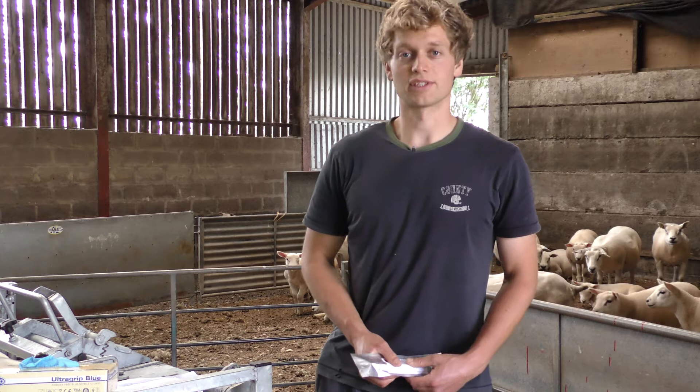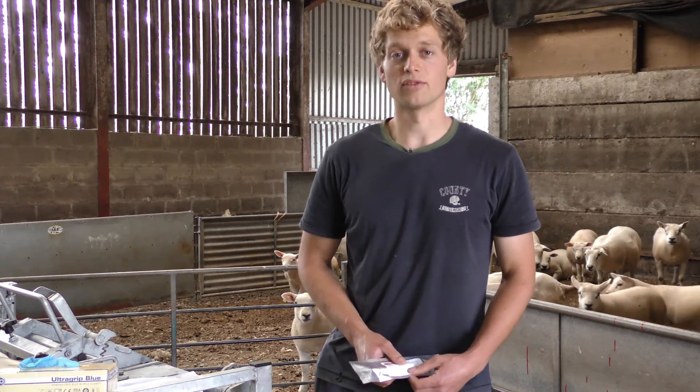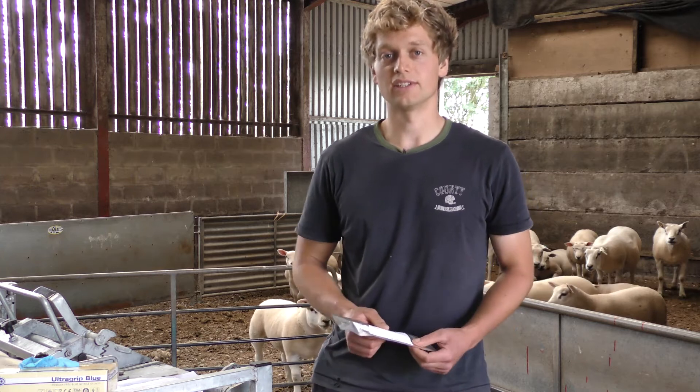Hi, I'm Will. I work for Texel Sheep Society and I'm going to show you how to take a DNA sample from a sheep by using a nasal swab.